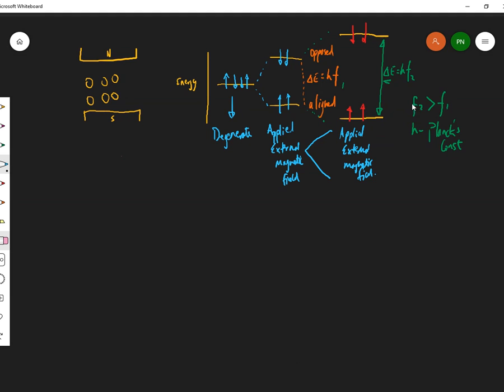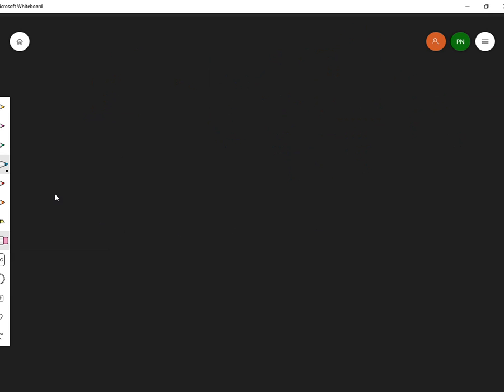All right. So this is what we did yesterday, wasn't it? What we're looking at here. All right. Now I'm going to get rid of this, and there you go. And now I'm going to do the machine. This is the NMR machine. And this is a schematic, which means a very basic diagram of the machine, the NMR machine. But it's all we need to know.